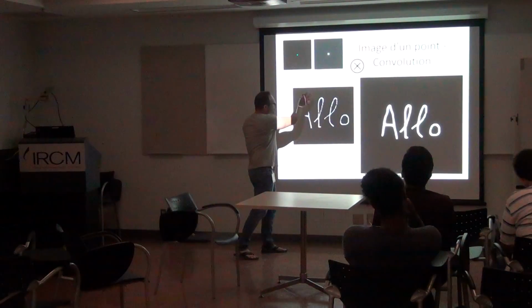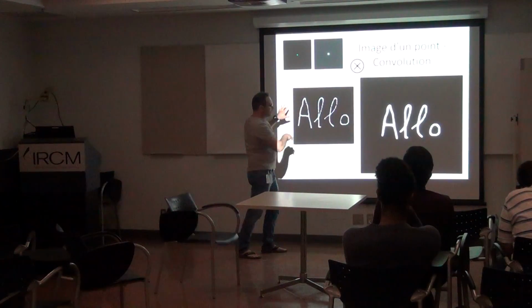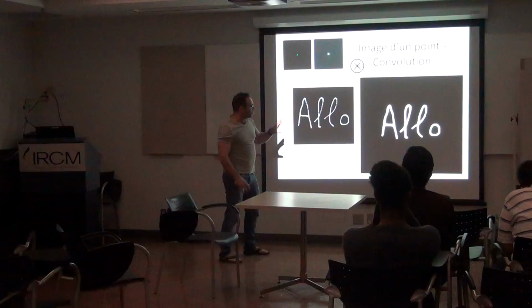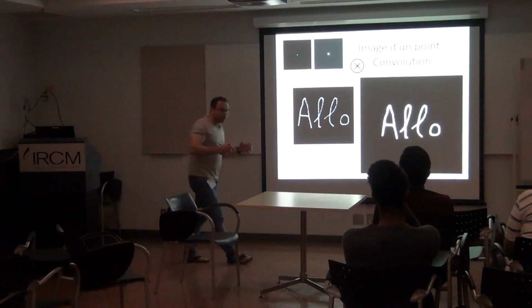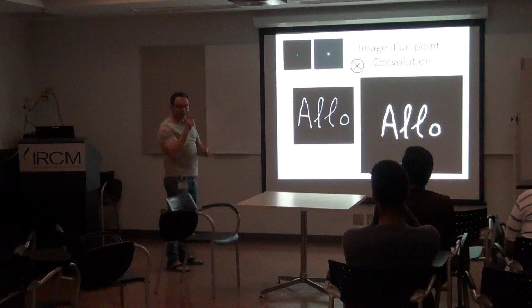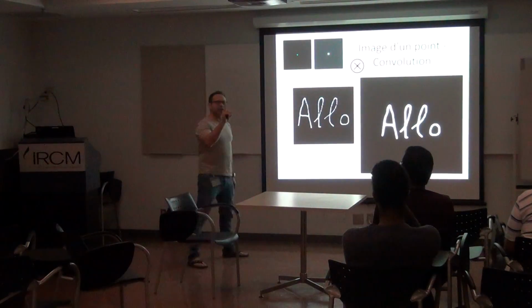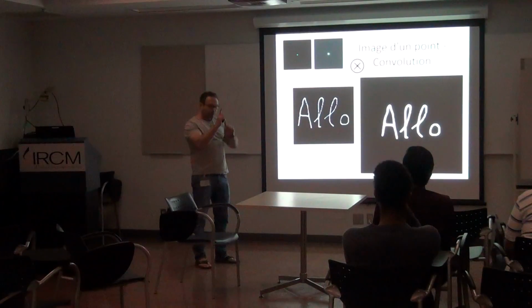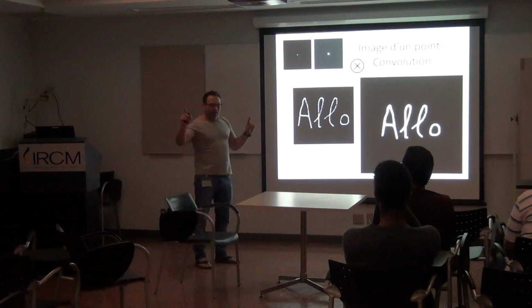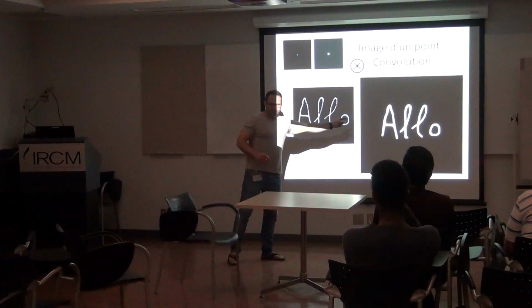So it's a multiplication of this function for every pixel here that produces the final thing, which is the product of convolution. Okay? And when you look into a microscope, every dot of light produces a pattern like this. So if you have a probe which emits light, it will produce a pattern like this. So if you have many probes everywhere, every probe produces a pattern like this. It's going to end up like this.